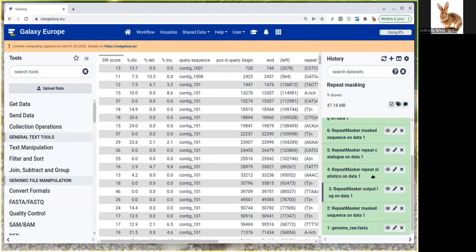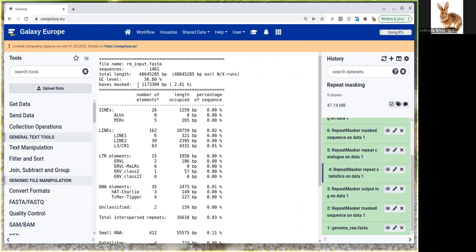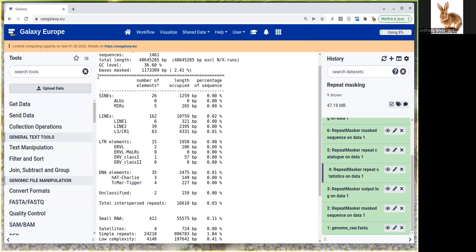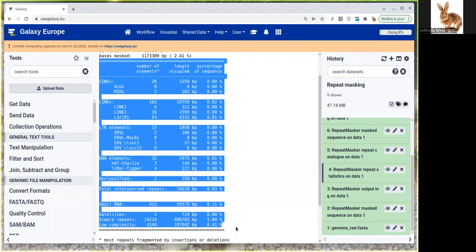Probably the most interesting thing, apart from the sequence, is the repeat statistics. There you'll see very useful information: the total length of the genome you tried to mask, the GC level, and very important, the number of masked bases in the genome. The number of bases found to be repeated by RepeatMasker and masked (either soft or hard). In this case, we have 48 million base pairs total, and approximately one million were detected as repeated, which is 2.41% of the genome.